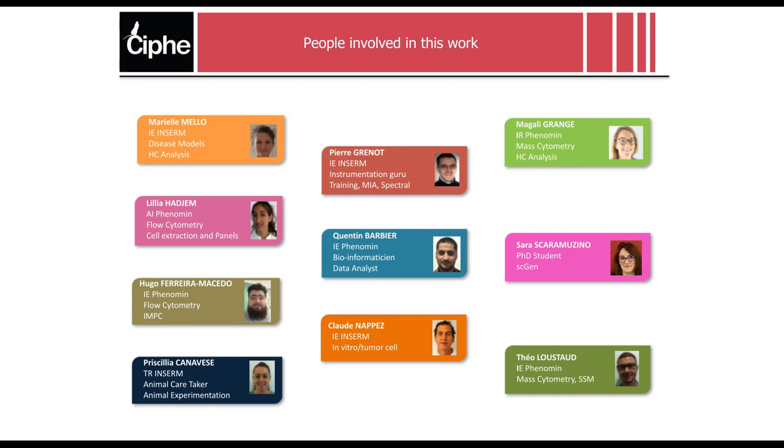And because we now have access through Cytobank to this historical data set, we can, as I explained, take the gating strategy that people are using and project cluster analysis or annotation onto it, which helps them better understand these advanced methodologies.